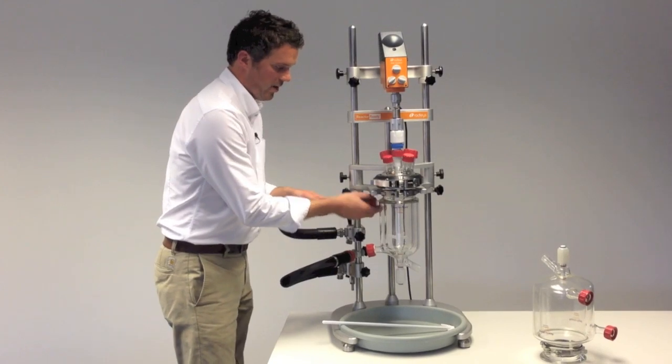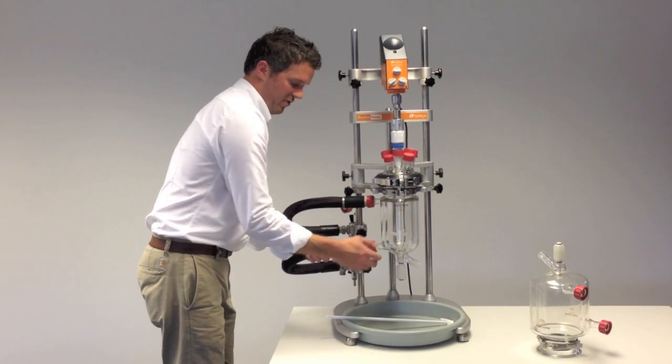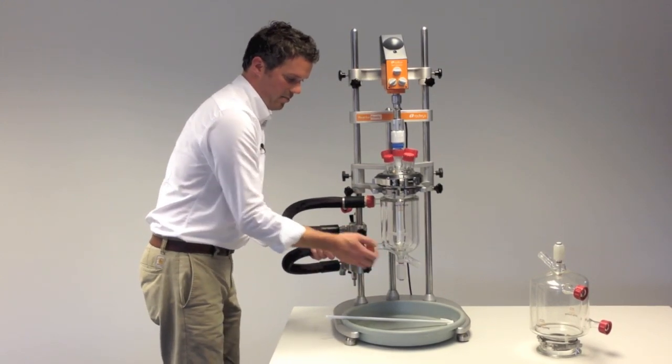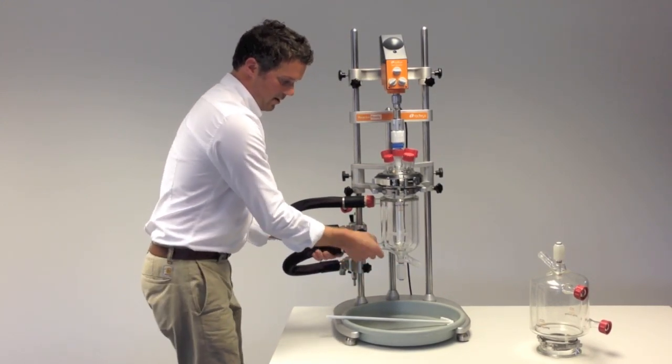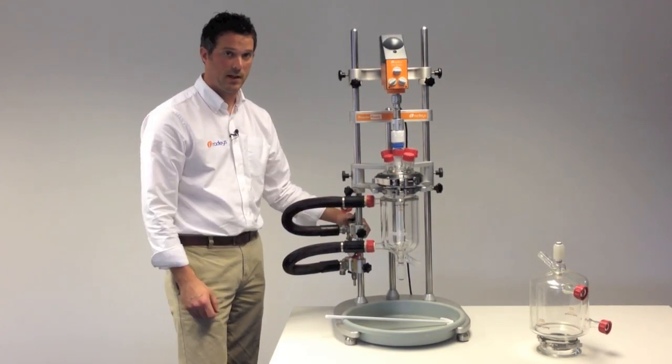And then reattach the hoses. Just push a bit and the red collars tighten them onto the sidearms. Then once you close the vent valve at the top you're ready to fill up from your recirculator again.